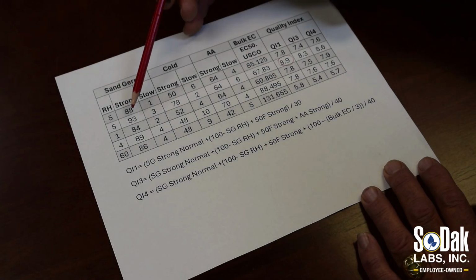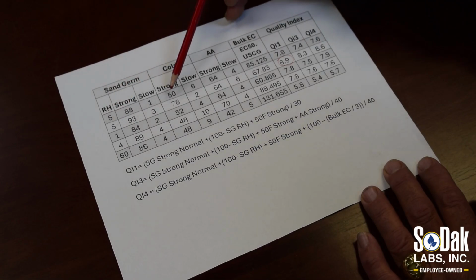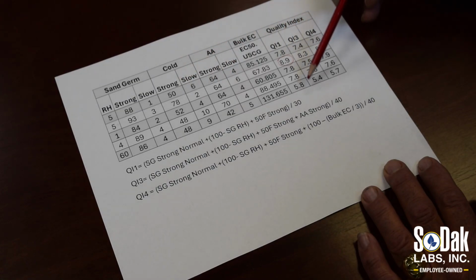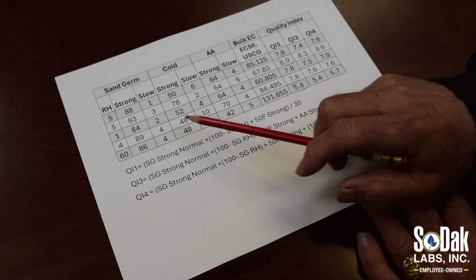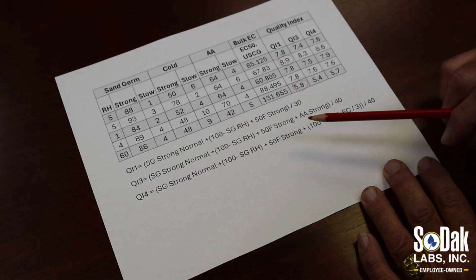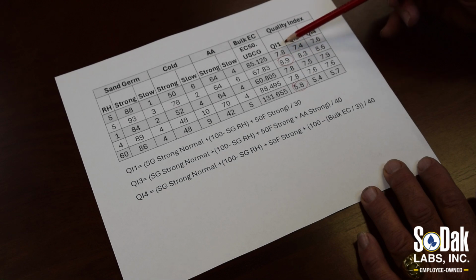And when you look at it, it has a 93 warm, which is very good. It only has 5% rhizopus, which we think is very good. Had a 78% strong cold, which we think is good. And so anyway, it gives you that 8.9. Where the one at the lowest range here, it had the most rhizopus, a lower warm, and a lower cold. So all trending lower. So a 5.8, not quite the strength that we'd like to see. And the other three basically are the same.